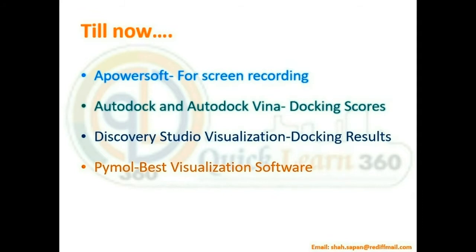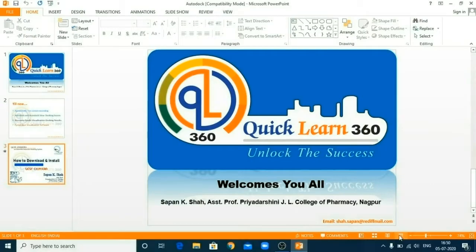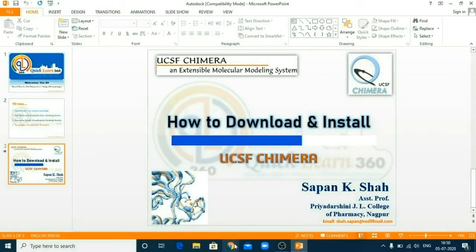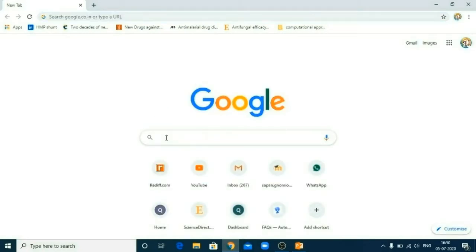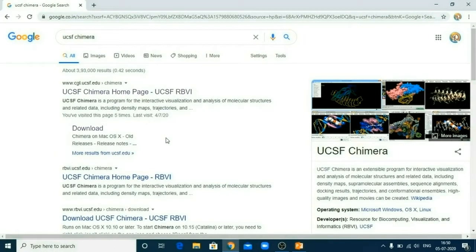So let's move on for today's session: how to download and install UCSF Chimera. This UCSF Chimera is an extensive molecular modeling system. So let's move on and check how to download and install UCSF Chimera. For that, first of all, go to your web browser. In Google, just type UCSF Chimera and open the website. The first link is for the UCSF Chimera official website.